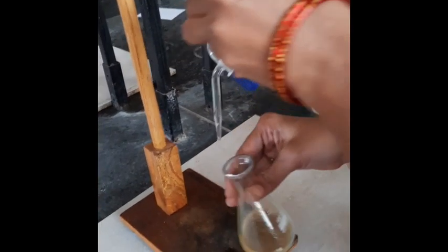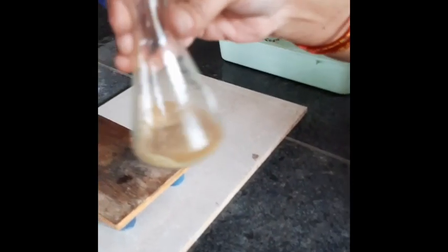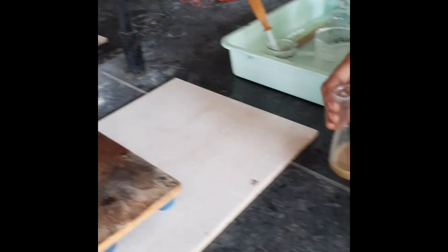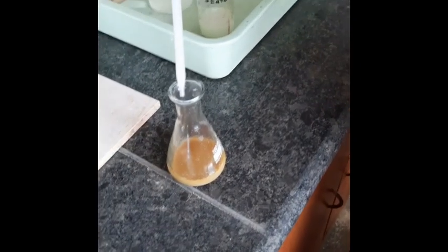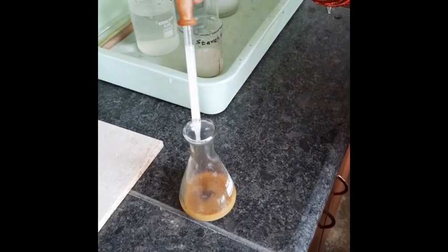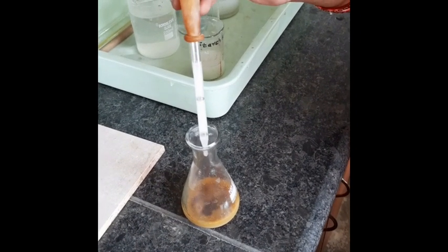Yes, now you can observe the change. Pale yellow color is obtained here, that brown color, yellowish brown, is removed. Now here, when the pale yellow color is obtained, you have to add the starch indicator to it. Okay, blue color is obtained.